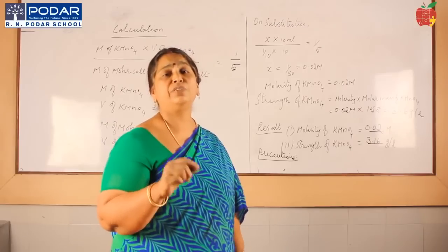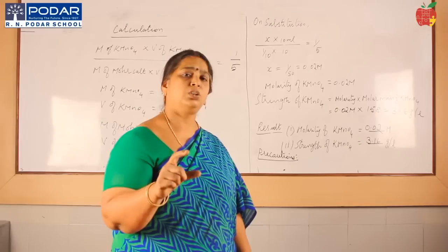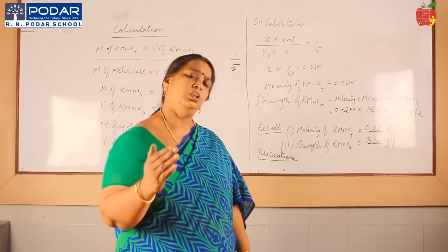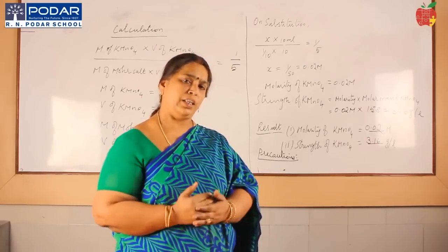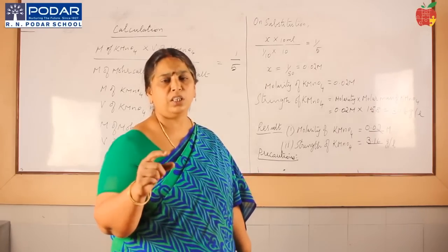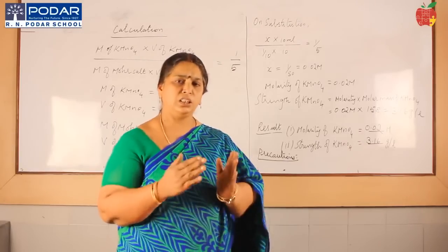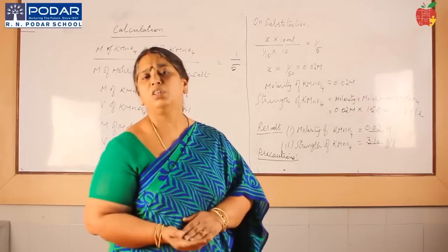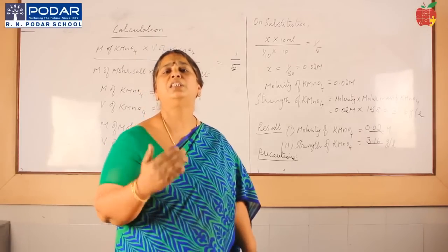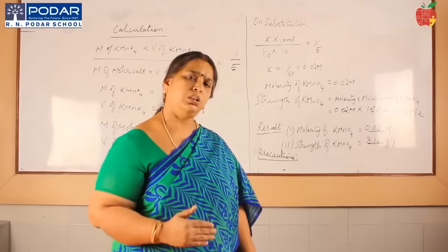And the second one is, do not forget to add dilute sulfuric acid to the Mohr's salt solution in the standard flask, to prevent hydrolysis, as we have seen in the experiment. So please do not forget to add that. And also 10 ml of dilute sulfuric acid is to be added in the conical flask after pipetting out to make the medium acidic. So the addition of sulfuric acid in the standard flask and in the conical flask is an important precaution. The first precaution will be washing and rinsing your burette and pipette with the respective solution. So at least these 2 precautions should be there.